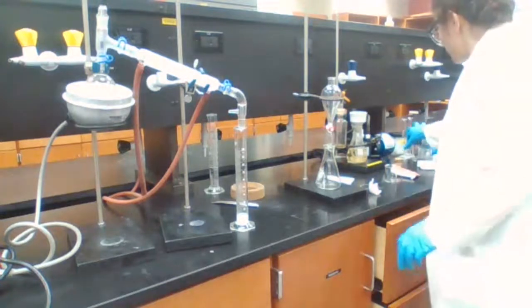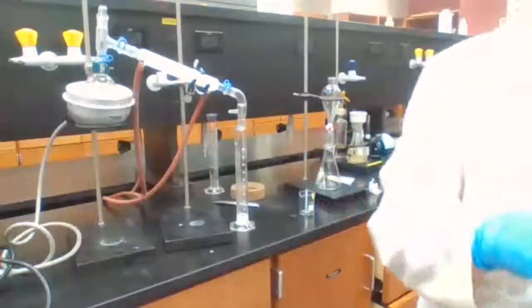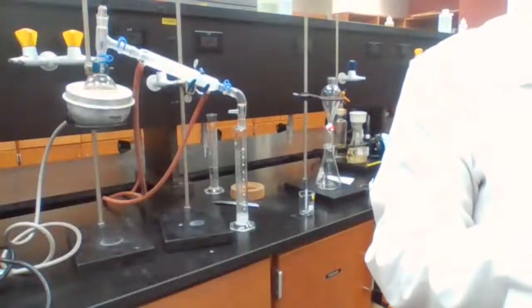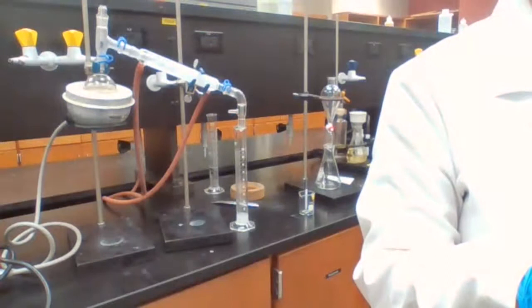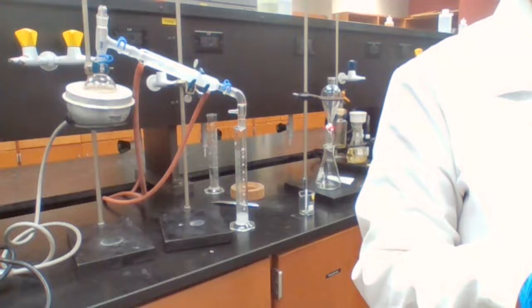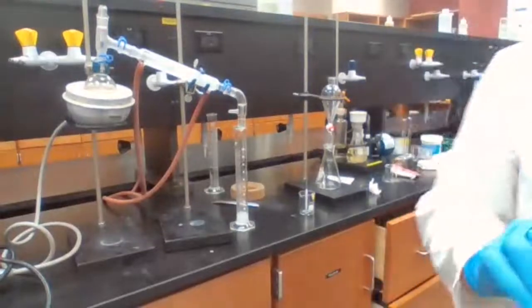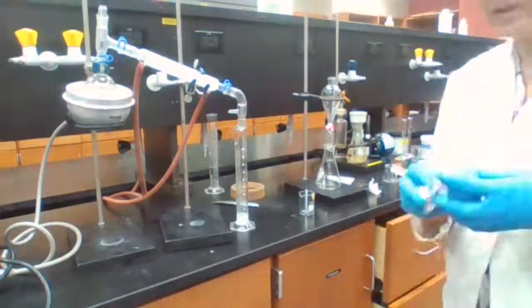Going to get ready for some methanol. Do we have any washing steps for separation? Just drying. Okay, just the separation. So I don't have to get my washing solutions ready.